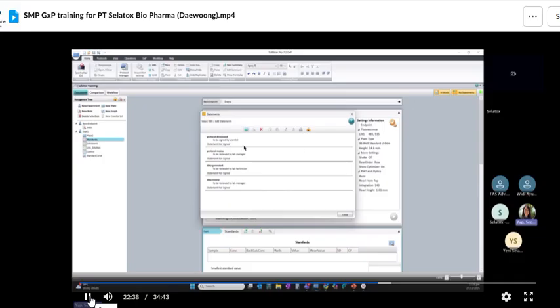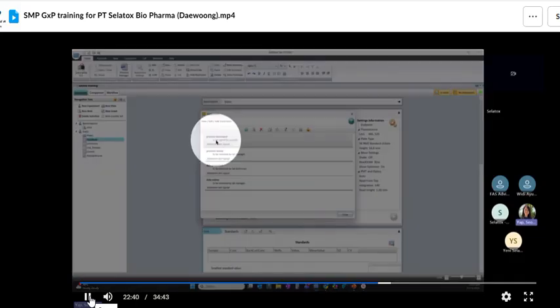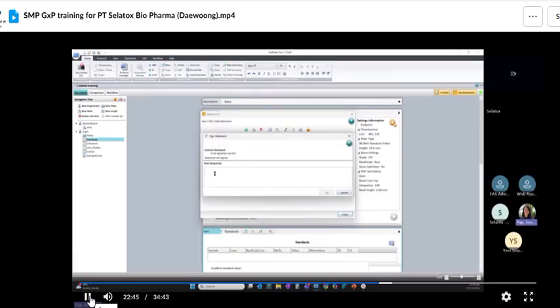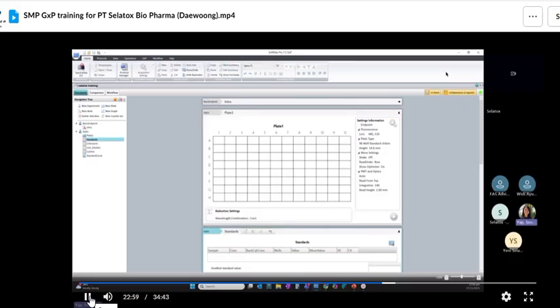So for now, I'm assigned this role, right? I'm going to click this, okay? And I click here, sign off, okay? You can type any comment or whatever, sign off, okay? Then it will ask you to confirm your username and password. All right, I'm going to close it.